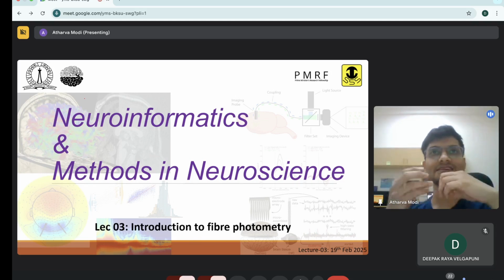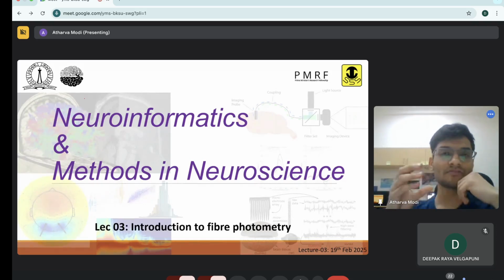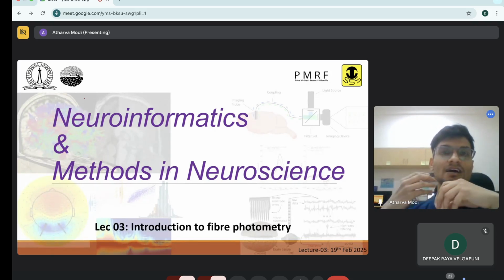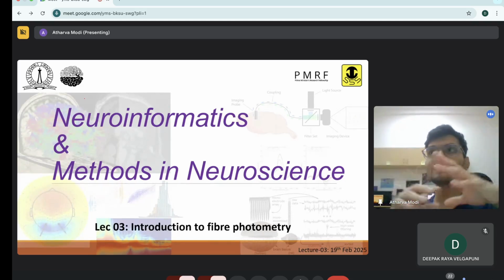So these are very recent developments in the field where this heat is then converted. This heat also results in vibrations inside the tissue, which ultimately results in ultrasound signals which we can capture from outside the brain. So these are all various different techniques.